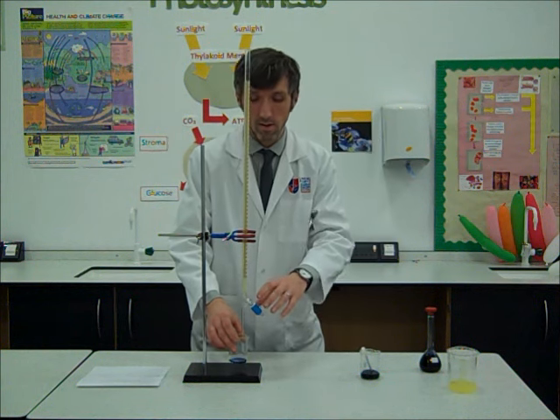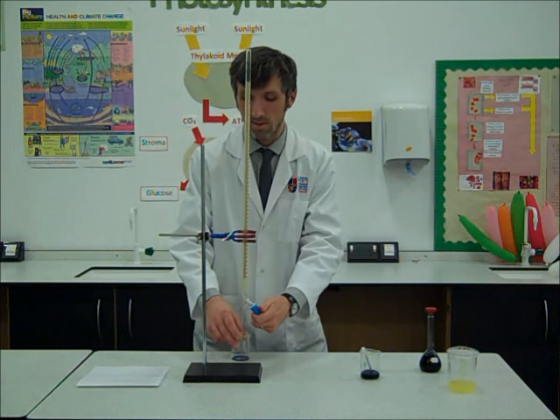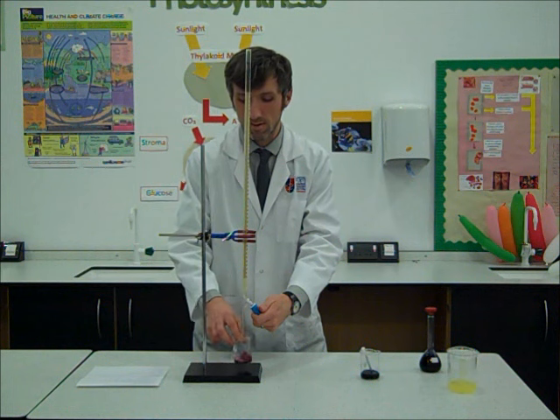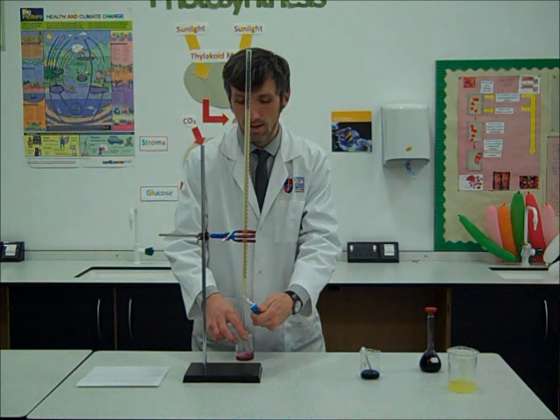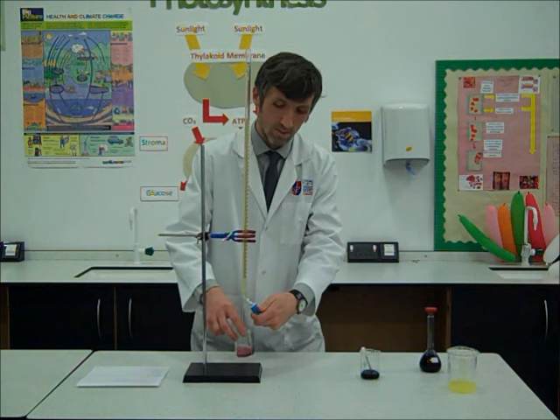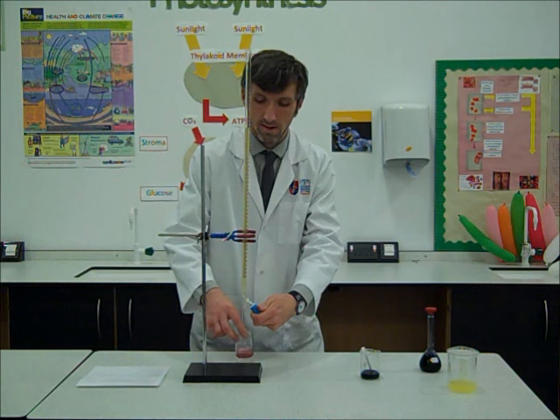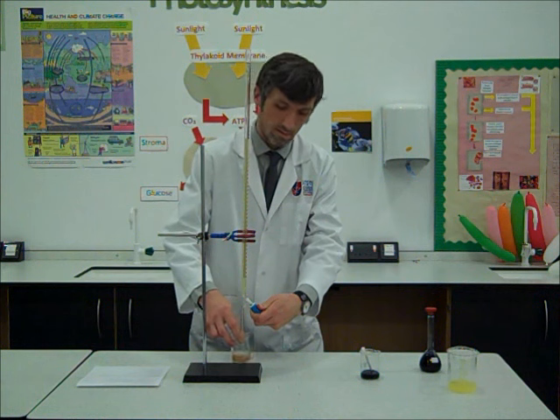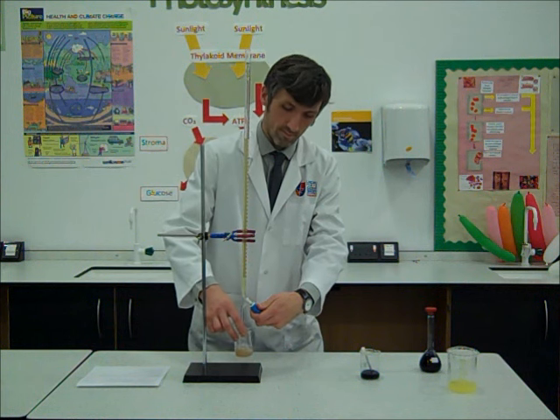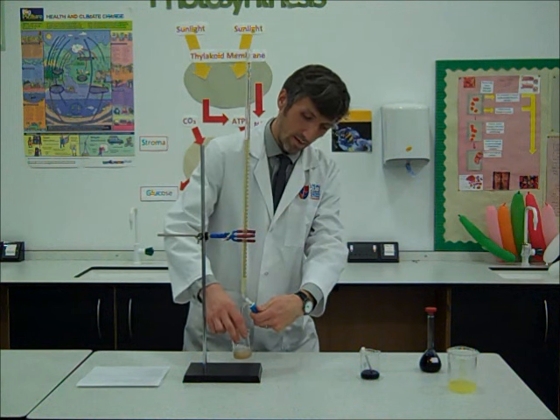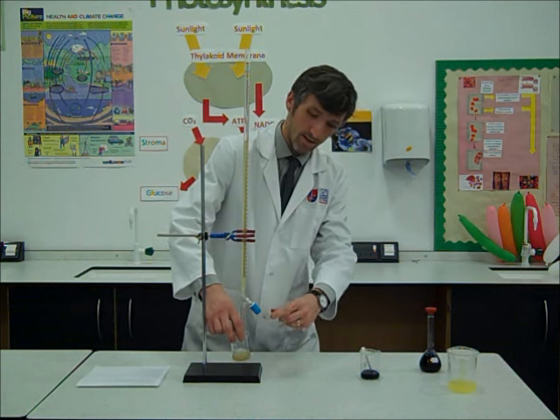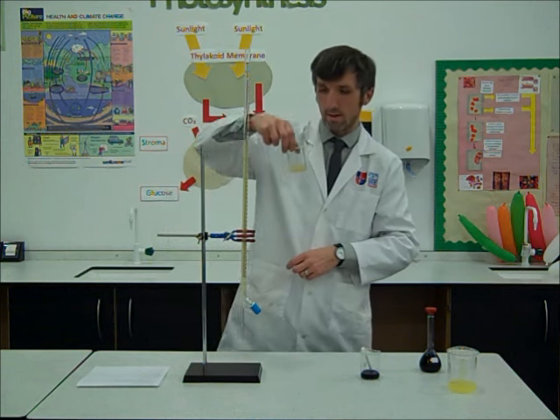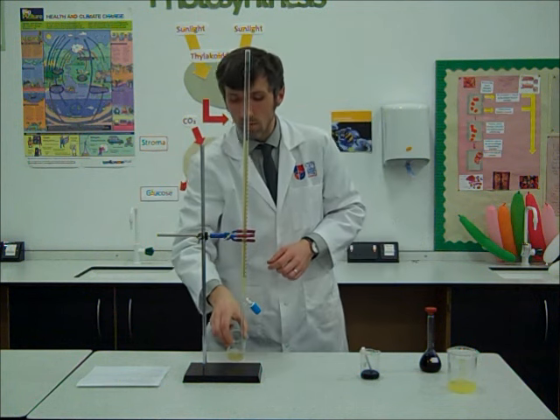We'll start off with a rough one. You would start off with a rough one because we're such experts at this. Keep it turning. It's when it loses completely that color. A little purple tinge still in there. There we go. That's gone colorless. See it's gone colorless. Record the volume.